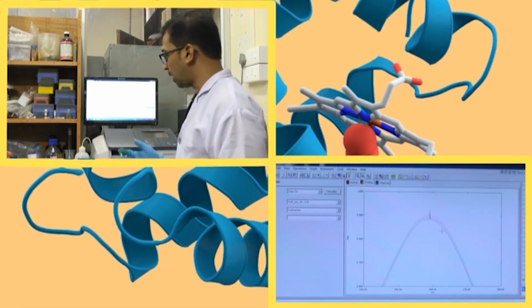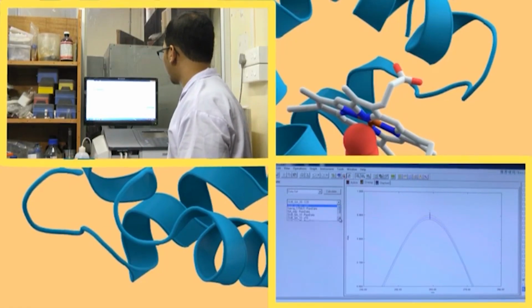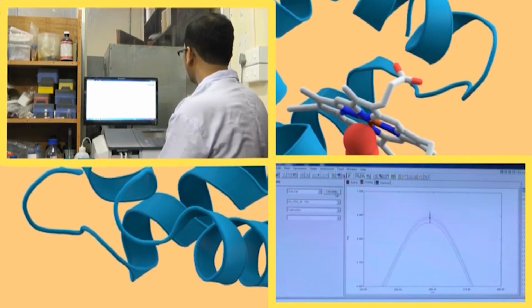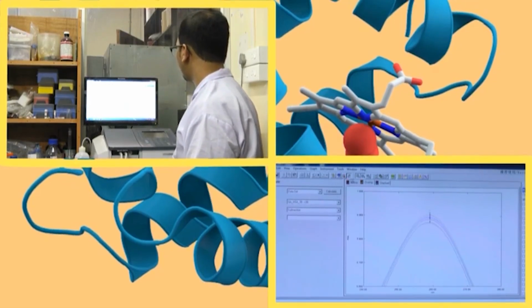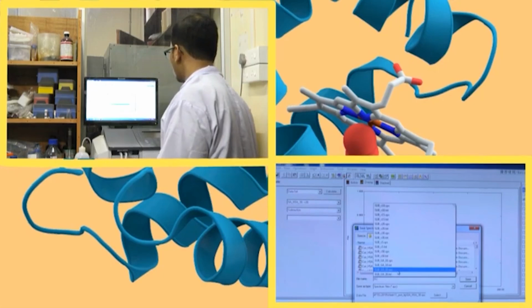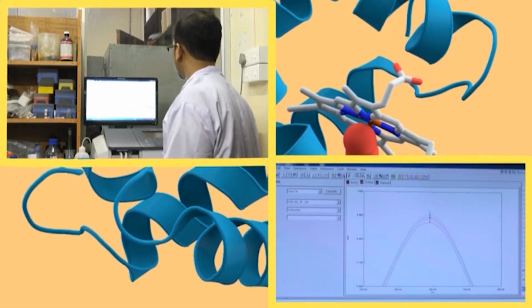Now, let us see what happens when you subtract for higher concentrations. HSA 30, HSA 30, calculate. Now, again here we can see this decreases. Save as SUB GA 30.